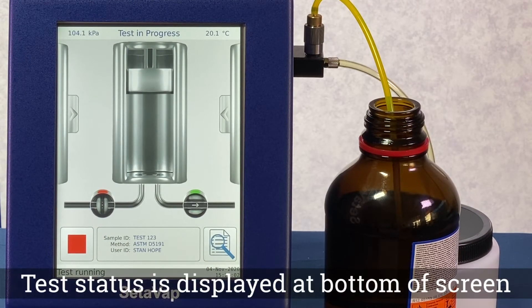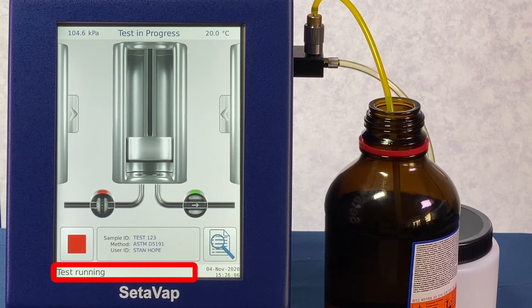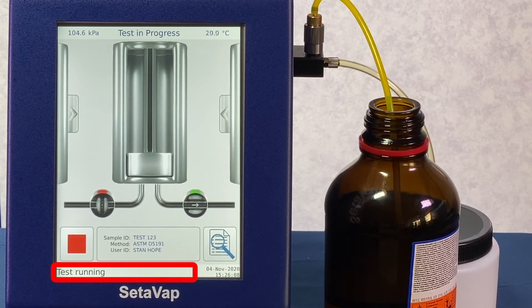During a test cycle, the status is displayed at the bottom of the screen. For the purpose of this video, the test footage has been sped up.